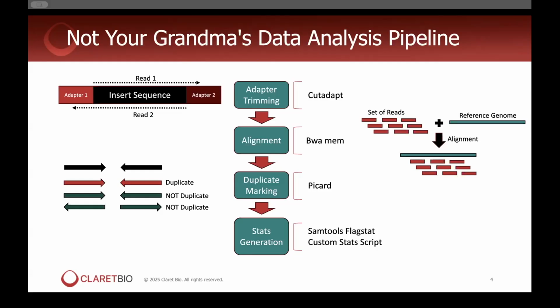And so we employ BWA-MEM in our pipeline. There are many different alignment tools, but BWA is one that we've been using for quite a while. And BWA-MEM is a local aligner, meaning that it can perform soft clipping. I won't go too much into details here, but BWA-MEM generally has much higher mapping rates than other tools, such as BWA-Align or Bowtie. And so in our case, because we're just interested in aligning and having as high of an alignment rate as possible, and we're okay with some soft clipping, we use BWA-MEM for this reason.